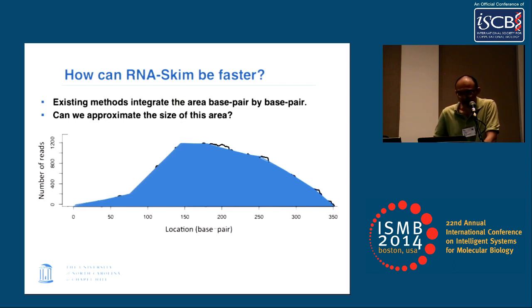So why does this work? Two reasons. First, RNA-Seq data itself contains noise and errors from the sequencing part. Secondly, the abundance levels of transcripts are actually random variables.